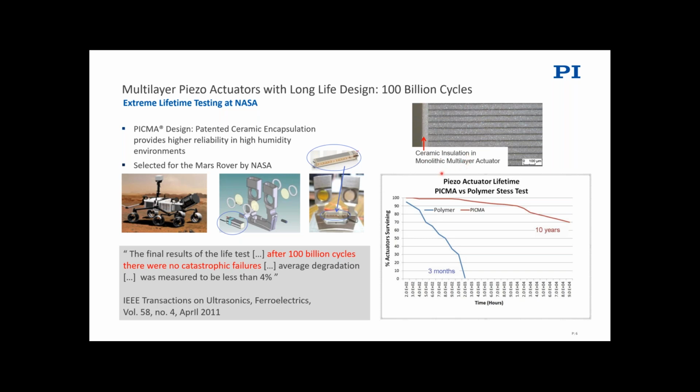And so this has really significant improvements for lifetime, also for robustness in different environments. And these were selected by NASA for the Mars rovers for this reason. So one of the primary uses of piezos in microscopy is in fast focus drives.